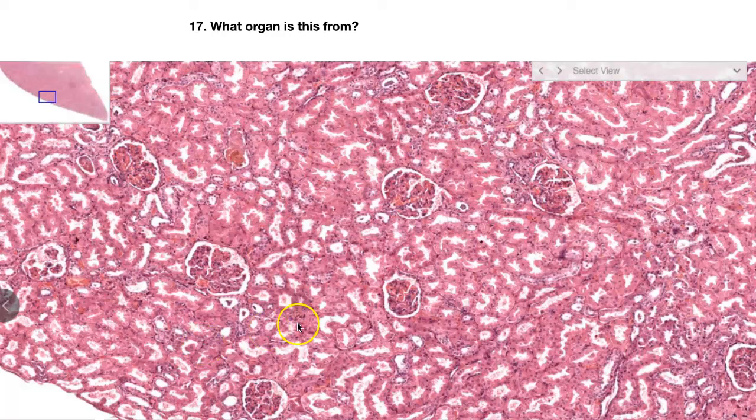Number seventeen — what organ is this from? You see lots of these structures and lots of lumens. Here's the lumen of all these structures. You'll learn about these when we study the urinary system — this is where we're making urine. This is the kidney.